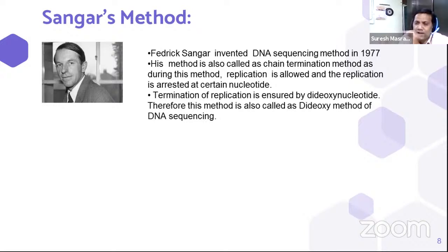Therefore, it cannot extend its hand for attaching with other incoming nucleotides, and replication is arrested at that place.